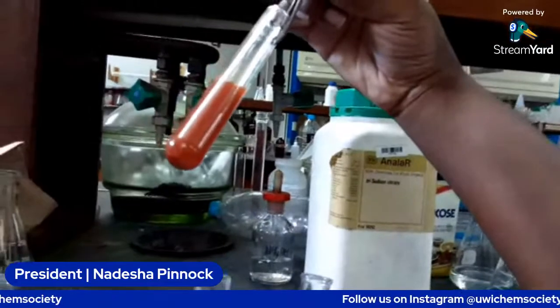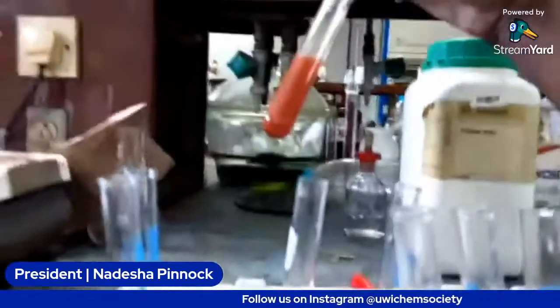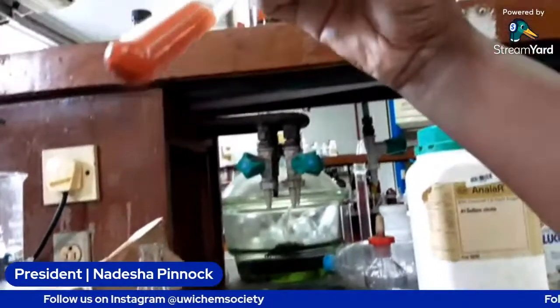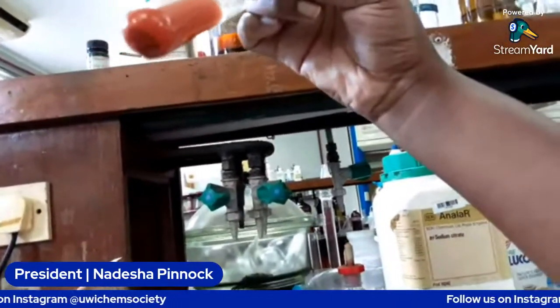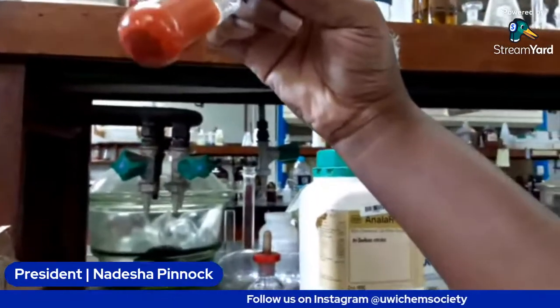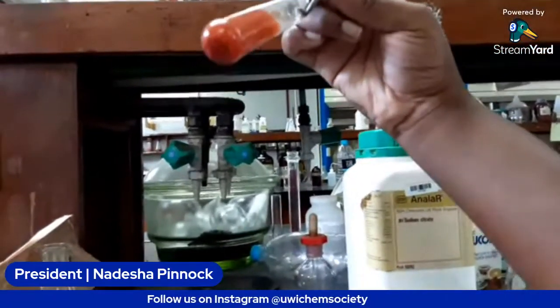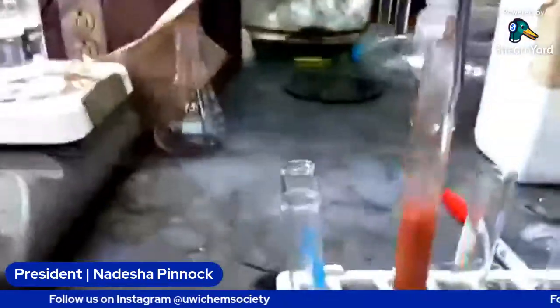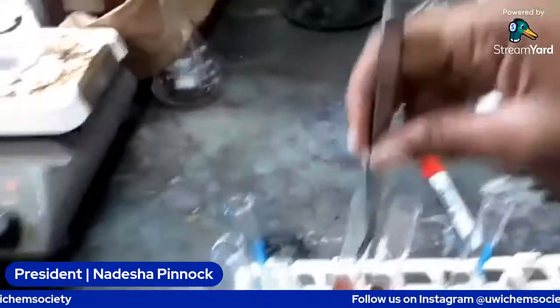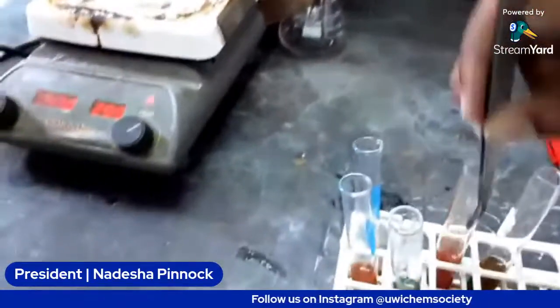All right. Let me try and see if this can focus. There you go. So you're seeing the precipitate there in the bottom. All right, so this would be a high sugar content, this one here.